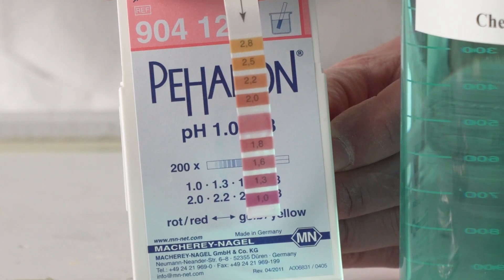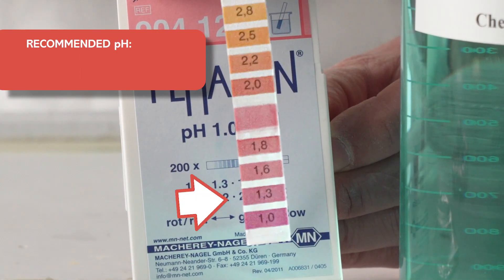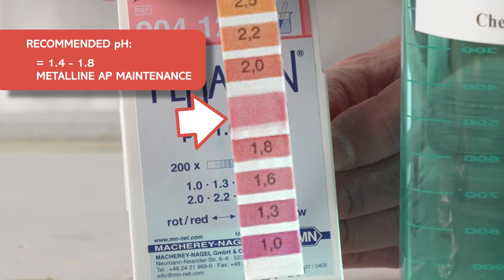The pH of the process solution should be checked frequently using pH papers and maintained between 1.4 and 1.8 using Metaline AP maintenance.